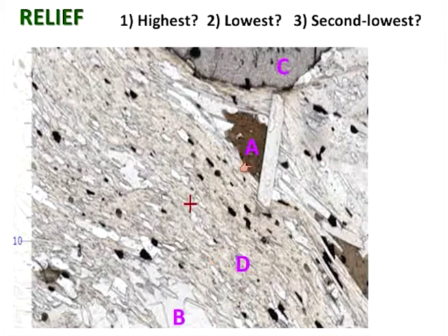The problem with A, this mineral up here, the brown mineral, and that's biotite, is that it does look quite a similar relief to the D mineral, the one next to it. In fact, this long lath-like shape here is actually a nice well-formed crystal of D, of muscovite. A is biotite, but often the colour of the mineral makes it look as if it stands out more.